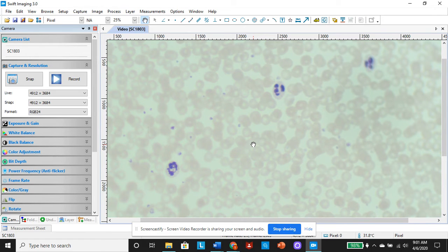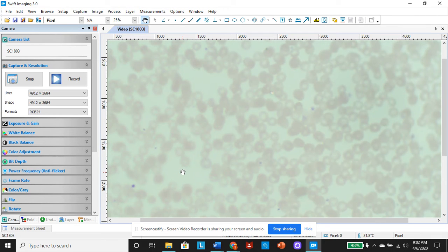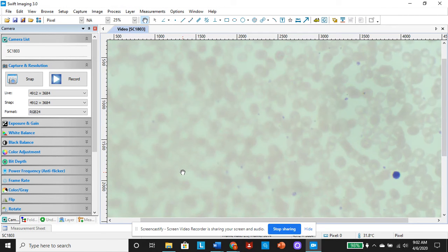All right, let's take a look around and see if we can find some other cool white blood cells. Right now, we are looking at 3 neutrophils. These are called your segmented neutrophils. They're probably the most common white blood cell in your blood. These guys help fight pretty much anything. They just kind of wander around doing their job. They have little granules in there. We'll get a little bit closer here on the oil, but they have little granules that are very, very light, kind of pinkish in color.